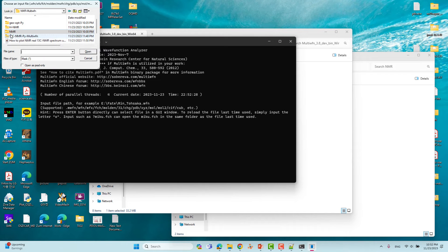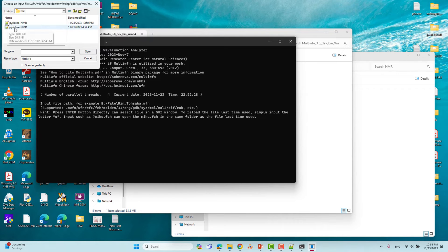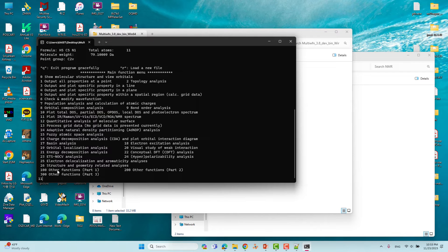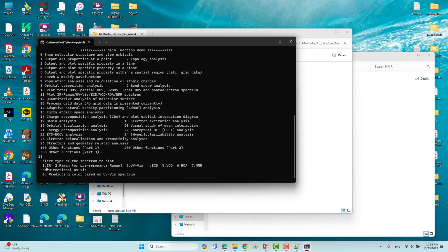This is the proton NMR folder. Click to highlight the output file and then click Open. The main function menu of Multiwfn will appear. You need to use function 11, which is the spectrum function. It offers IR, Raman, UV-Vis, ECD, VCD, ROA, and others. Type 11 and press Enter. Then you will see the spectrum sub-menu — the seventh option is NMR spectrum. Type 7 and press Enter.